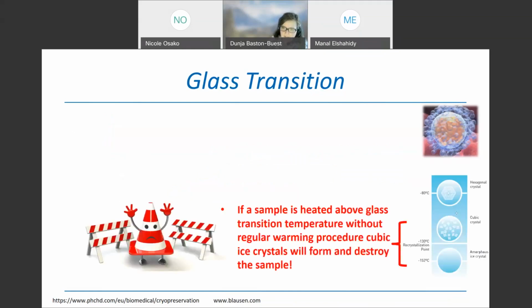But what happens if a sample is heated above this glass transition temperature? There will be cubic ice crystals formed in the water, and these will destroy the sample, so it will definitely get damaged.